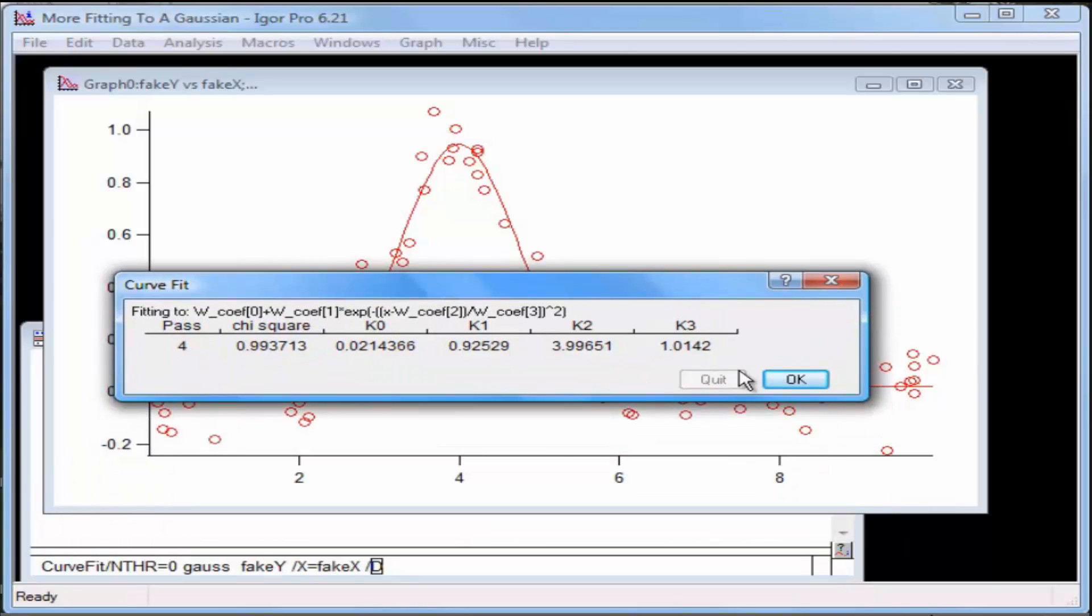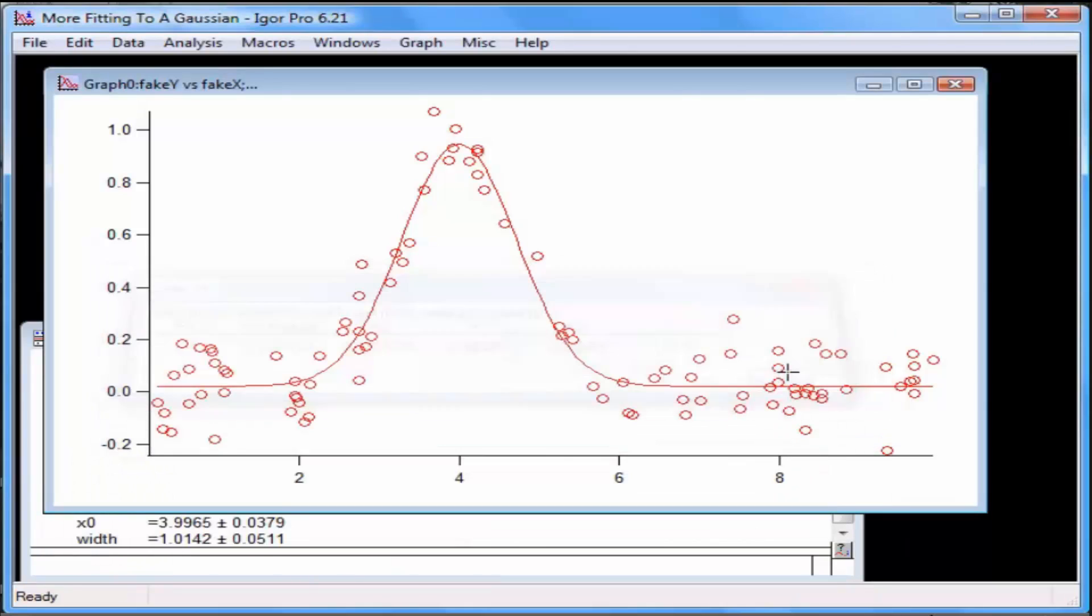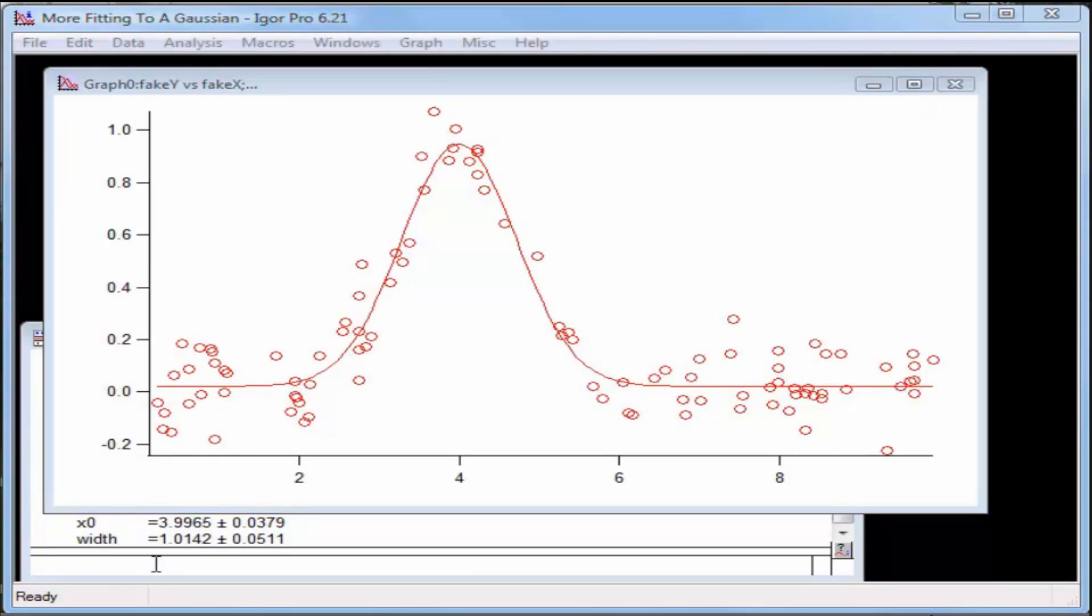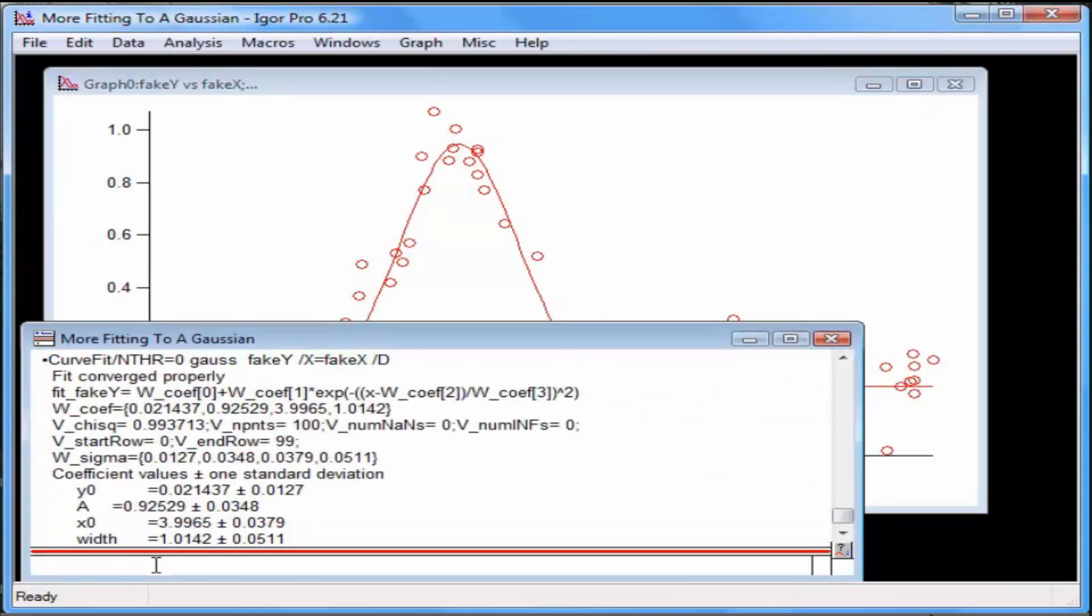Click OK. This will print the results to the History area of the Command window. Click on the Command window to bring it to the front. The results will be the same as for the Quick Fit in the previous tutorial.